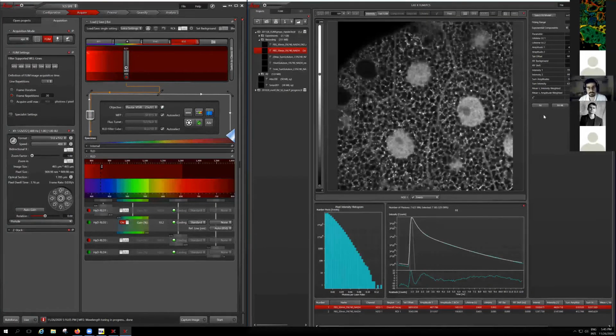But in principle, something about 1,000 to 10,000 is recommended. And when it goes to the third component, the number just explodes because of the degrees of freedom in fitting a three-component decay. It requires so many data points statistically to avoid artifacts or miscalculation and so on.